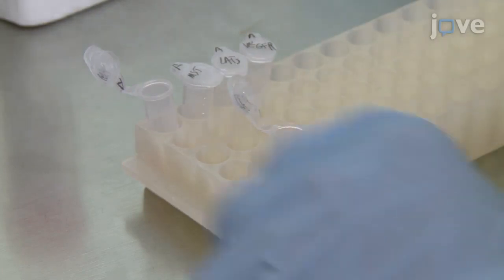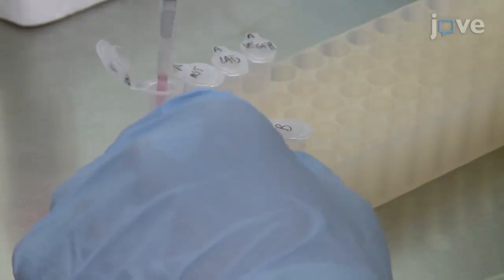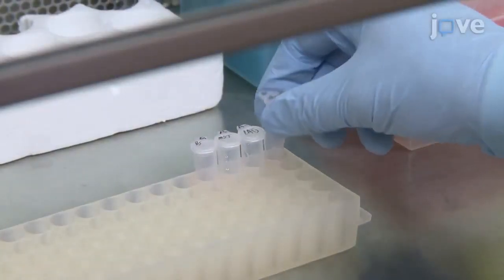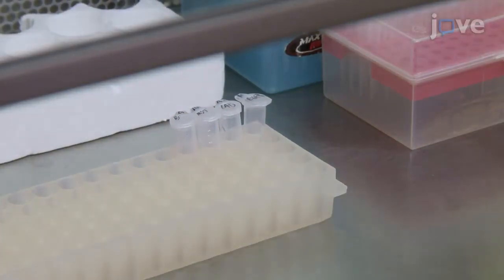After this, immediately add Solution B to Solution A and gently pipette up and down to mix. Incubate the sample at room temperature for 15 minutes to allow the transfection complex to form.